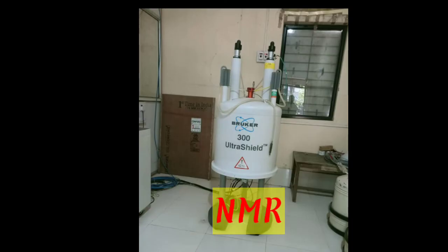The next instrument is NMR, Nuclear Magnetic Resonance Spectroscopy. When a nucleus that possesses a magnetic moment is placed in a strong magnetic field. In NMR spectroscopy, we use H1 NMR and C13 NMR.